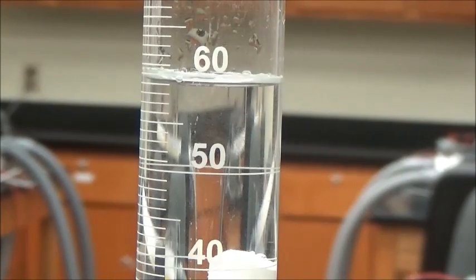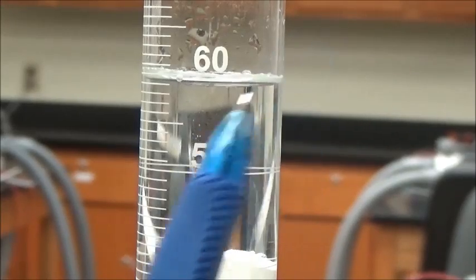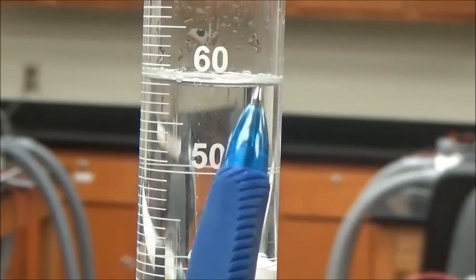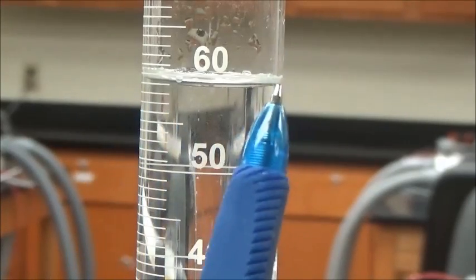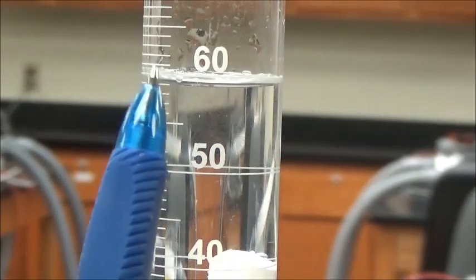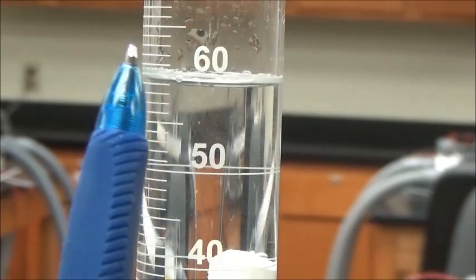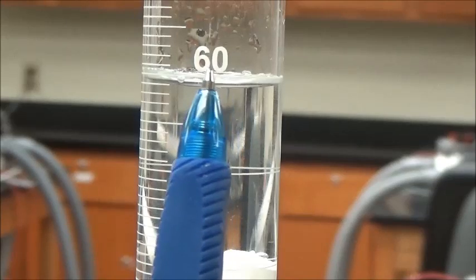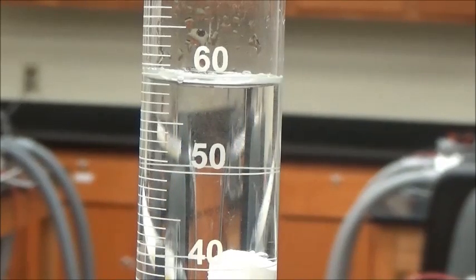Now, of course, we have to measure to the bottom of what we call the meniscus, because the water goes higher on each side because of the surface tension, what we call adhesion, as these molecules adhere to the side of the glass. So we always read it from the bottom. From the bottom to the bottom was 59.